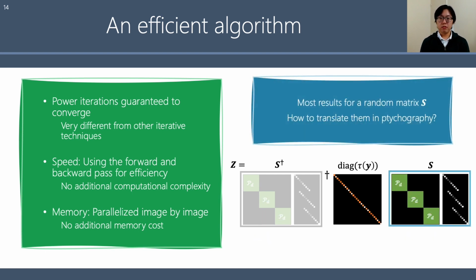For all these reasons, spectral methods have gathered a lot of attention from theoreticians studying the phase retrieval problem. They usually tackled the generic case where the matrix S is completely IID random. This is not the case in ptychography. Here, we see that S presents this block structure with a probe illumination and with propagation. Next, Lorenzo is going to show how to translate these findings to the practical case of ptychography.